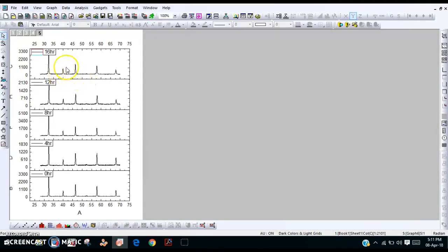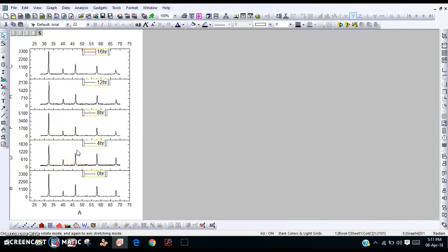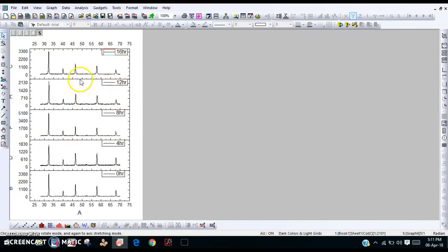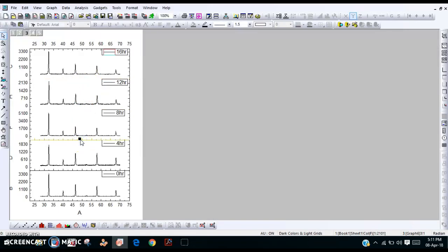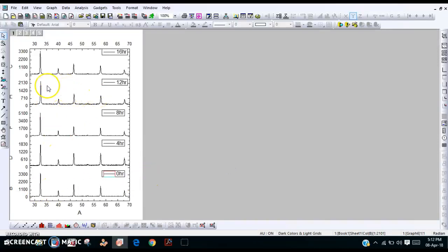First, select all the captions using Ctrl, then move them with the cursor to the right side. Then select the lines and delete them — delete all these lines. Now change the range of the X-axis from 28 to 70. Now it looks better.